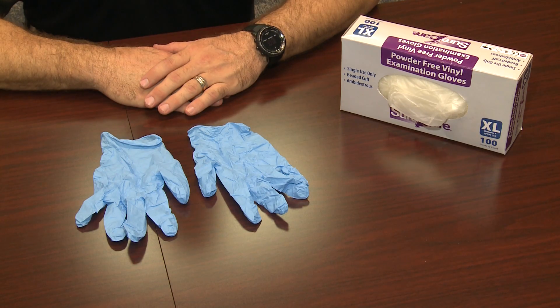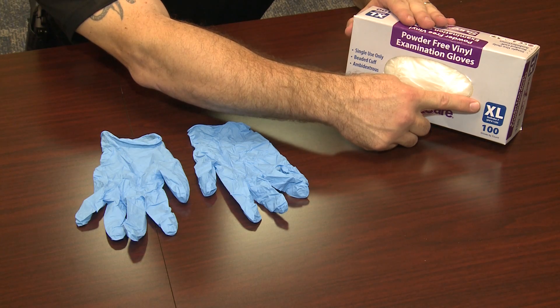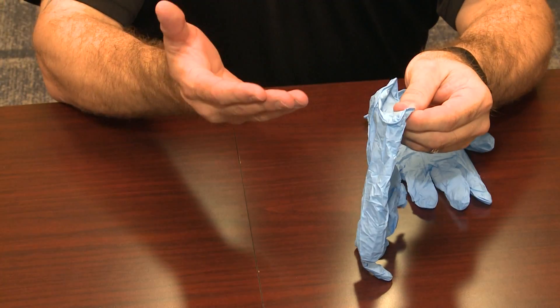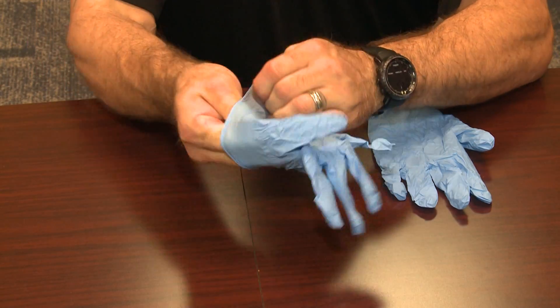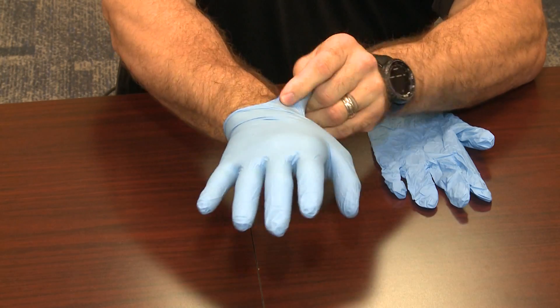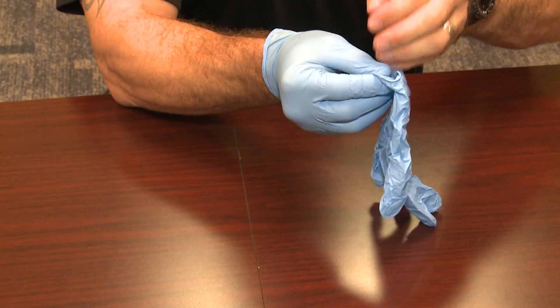Donning the Gloves. Find and know your appropriate size — this should be done prior to needing PPE. Secure the glove by the cuff and place your hand directly into the glove, and ensure the fit and integrity of the glove. Repeat the process for the opposite hand.